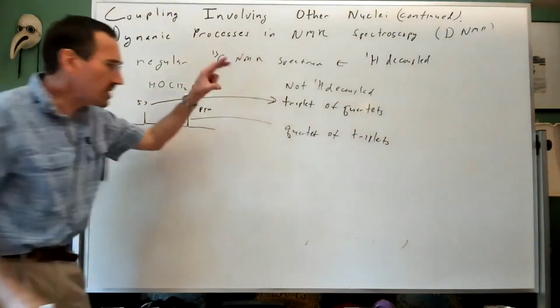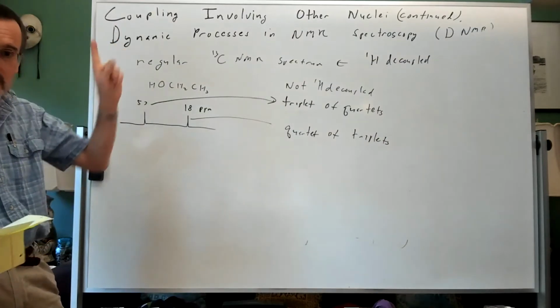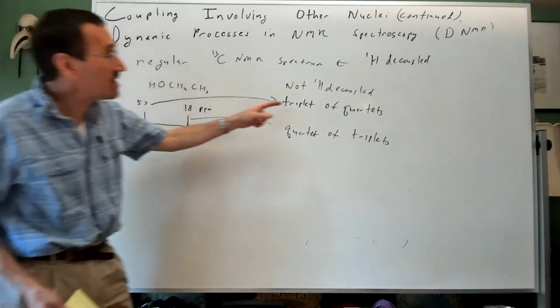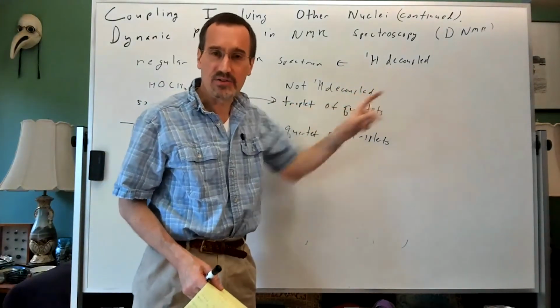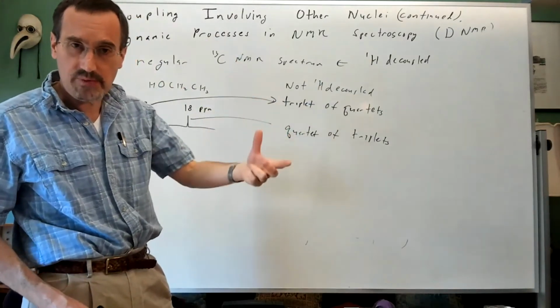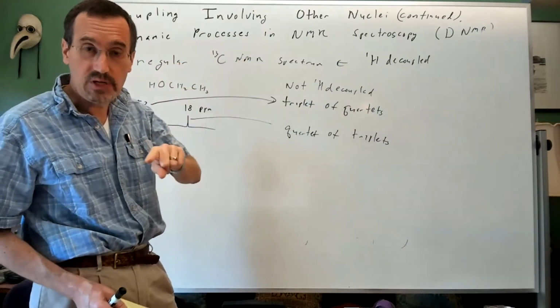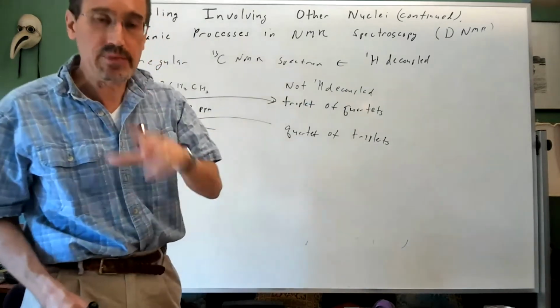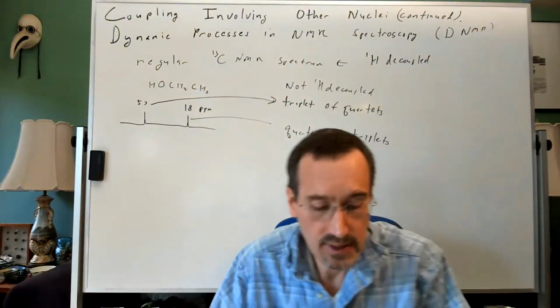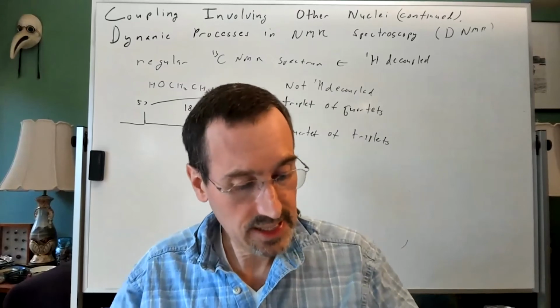And all of the peaks would be way shorter, and your spectrum would be way noisier because your signal peaks wouldn't rise that much over the noise. And I hinted before that your H1 decoupling not only concentrates your peak into a singlet, but you also get a nuclear Overhauser effect. That's the perturbation of those very small differences in population by the larger differences in the proton population. So your singlets end up being about twice or so taller than they would otherwise be. All right. Thoughts, questions at this point?